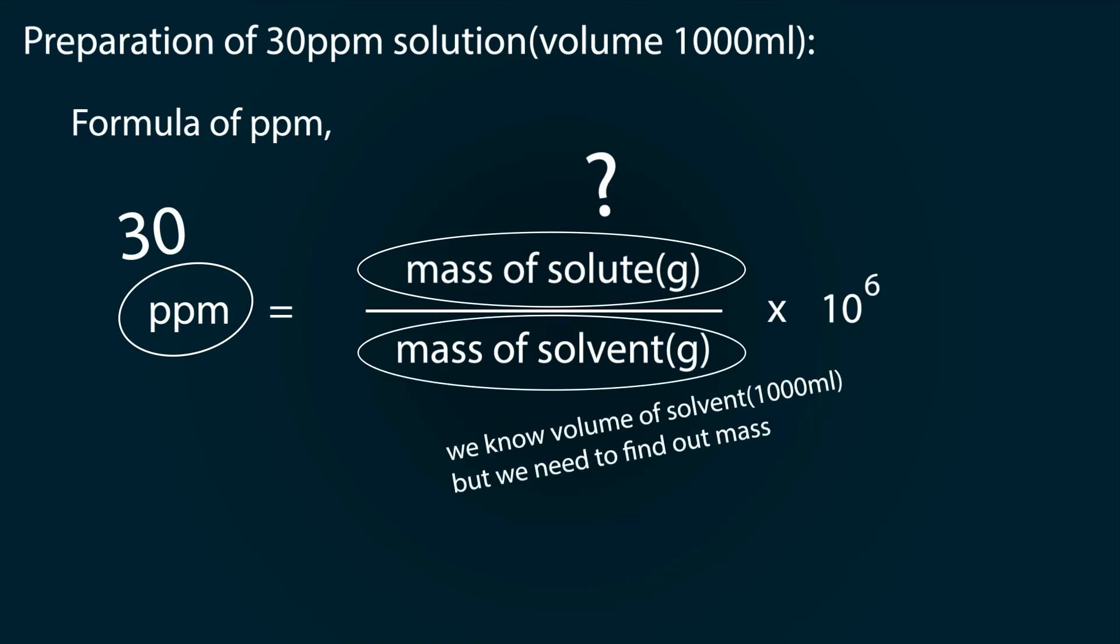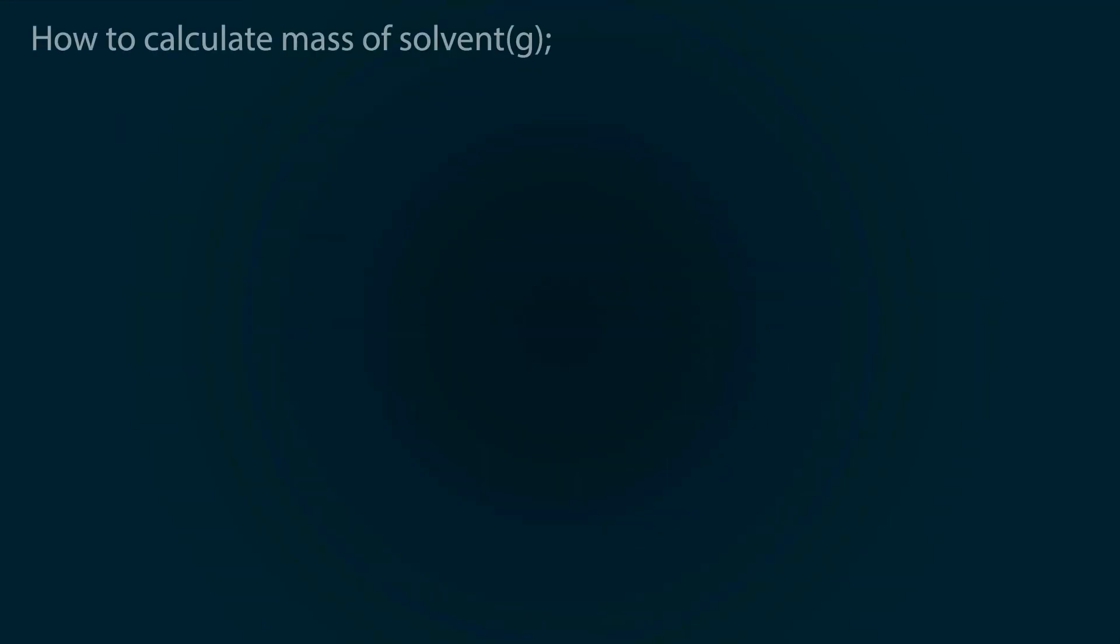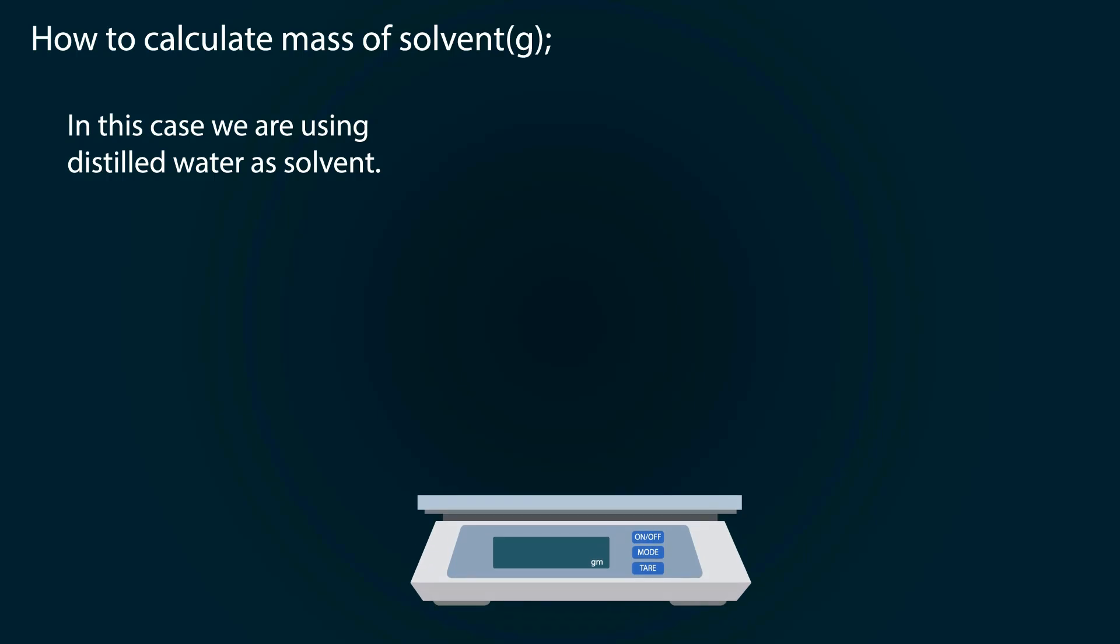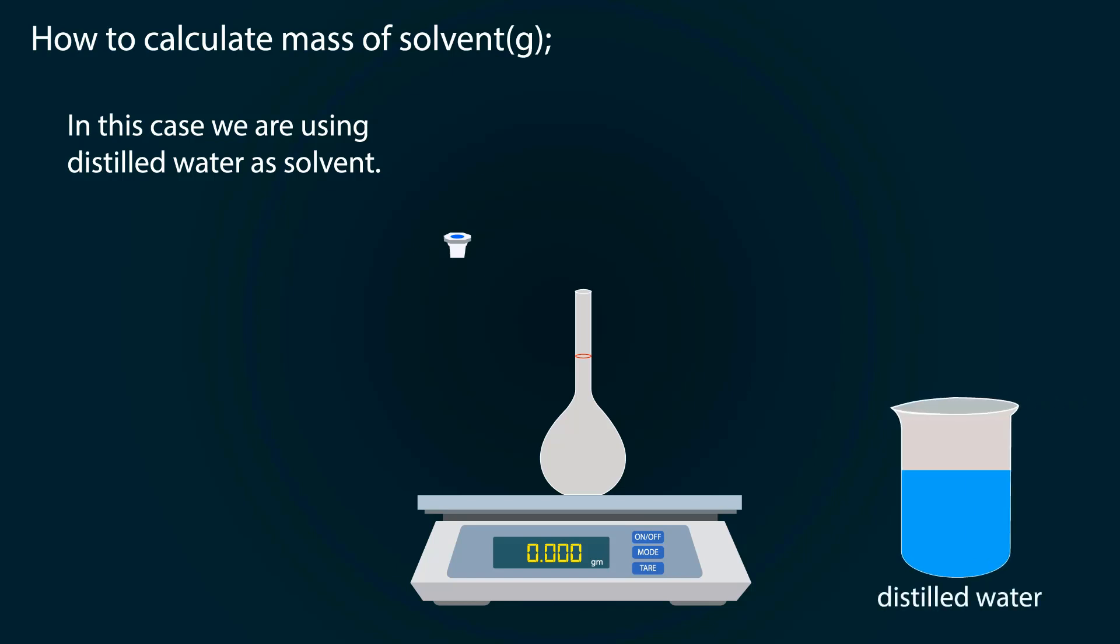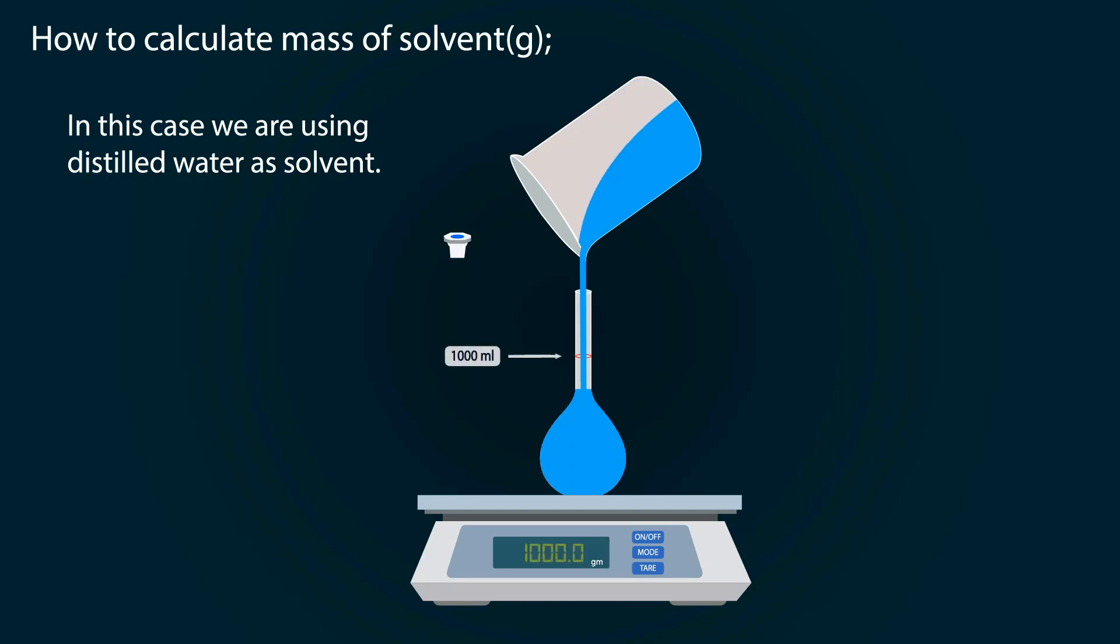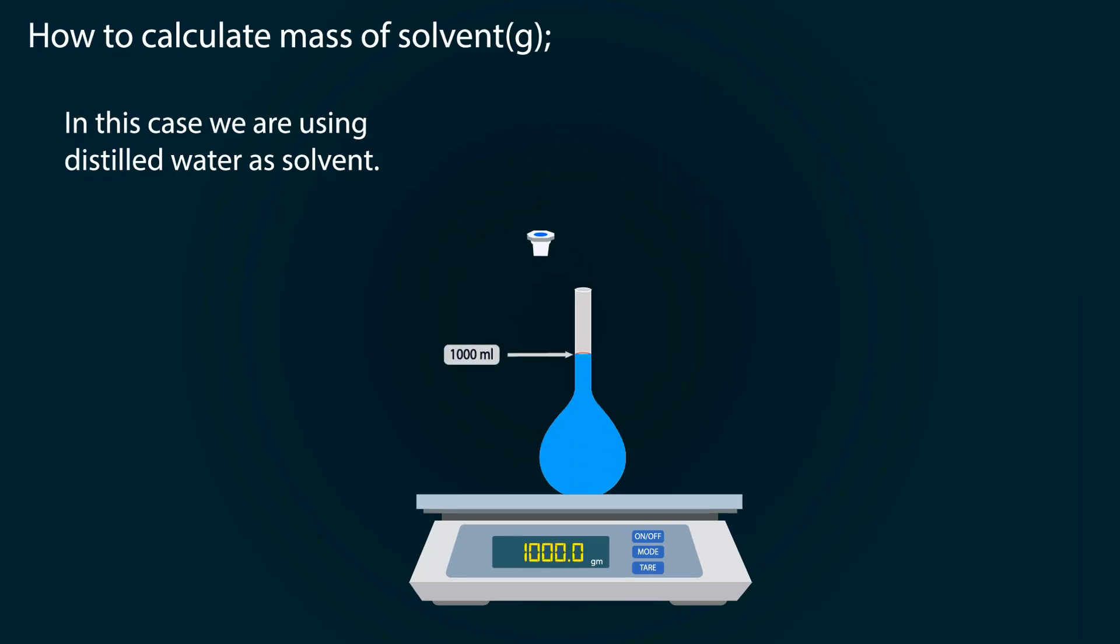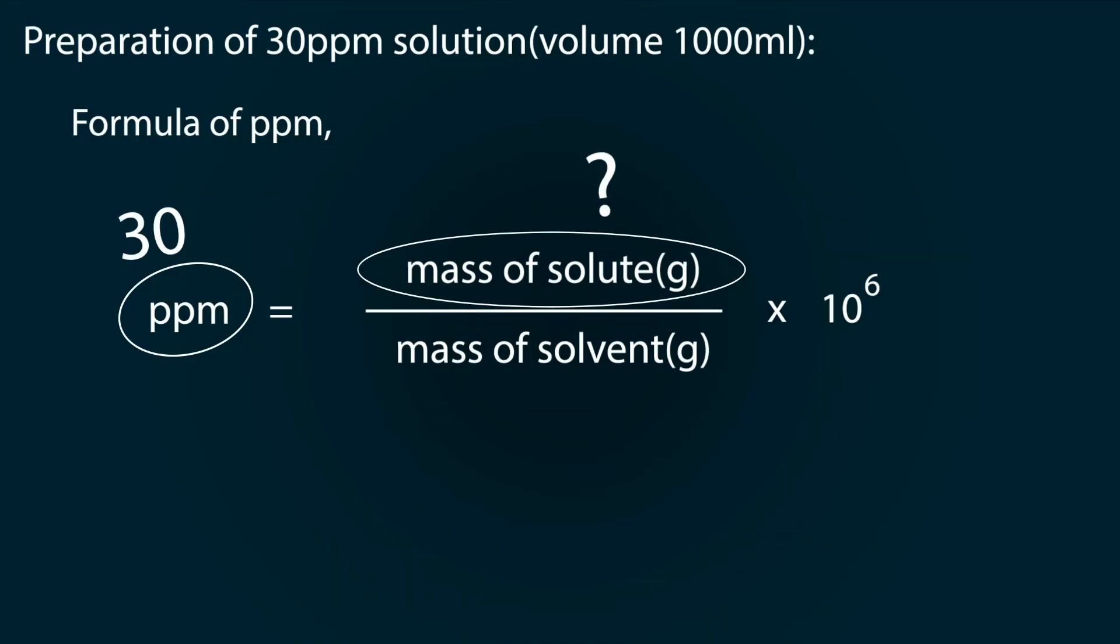But first of all we have to find out mass of solvent of 1000 ml. Here we are using distilled water as a solvent. Take a weight balance and power it on. Put the volumetric flask on it. Don't forget to tare it. Now start adding distilled water into the volumetric flask. Fill the water up to the 1000 ml point and note the reading. We have 1000 grams of solvent.